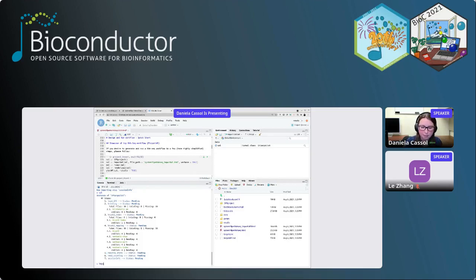Also here, again, we can check the length of the object, and you see we have 7 steps. The other thing we can quickly see here is the status of the workflow, in each one of those steps. You can see it's all pending. That means everything is rendered here. We have access to everything. However, we haven't run this yet, so it's in a pending stage.